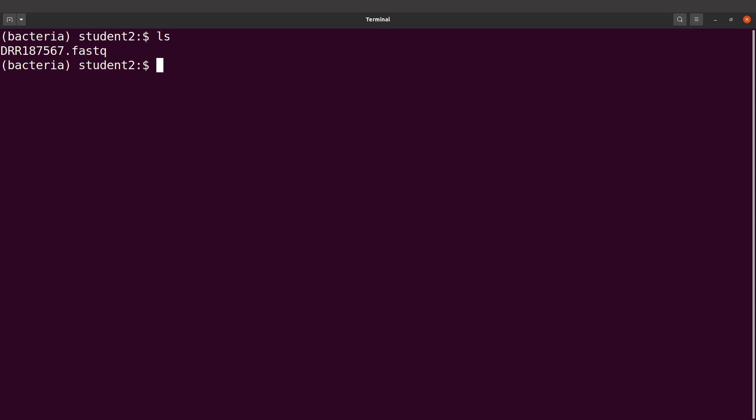So let's first create a QC report output directory. I'll say make directory qc_reports. Perfect.